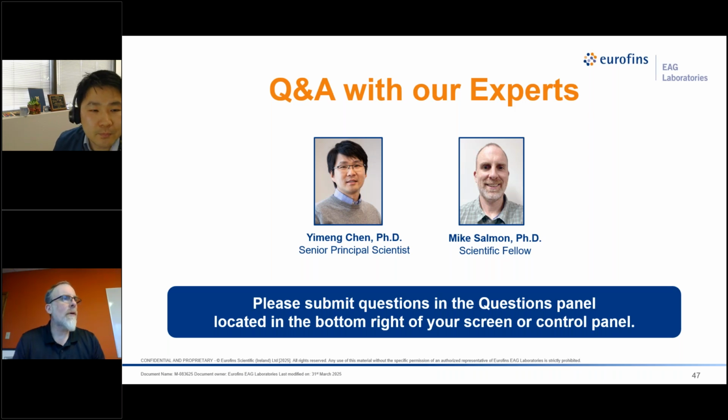Great. So, a few structural questions here. Let's see. The first one is, can you use atom probe tomography to find defects in crystal structures? I'll expand on that a little bit to include a couple other questions that came in, specifically about looking at vacancies, for instance. And then after that, some questions about whether you can actually measure hydrogen and carbon reliably with APT. Oh, yes.